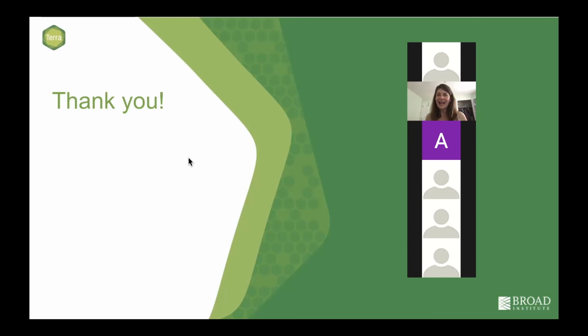Yeah, definitely. I have a tangential or related question too. People publish new tools, like if there's a new version of Seurat or something, is that going to get updated on Terra quickly as well? Yes, it actually does get updated pretty quickly, quicker than I would like, because I have to go in and check the work of the notebooks and make sure they work. And I'm like, oh, gotta update this. So it does turn over pretty quickly.